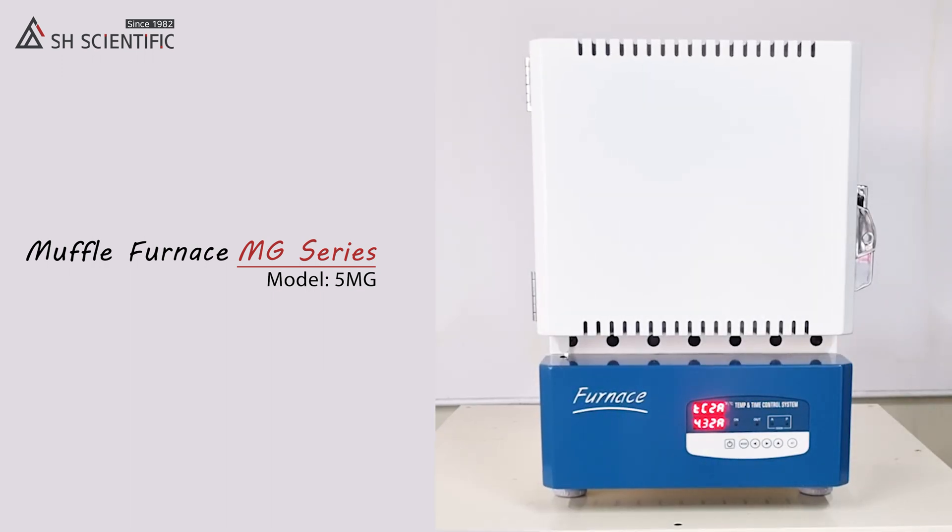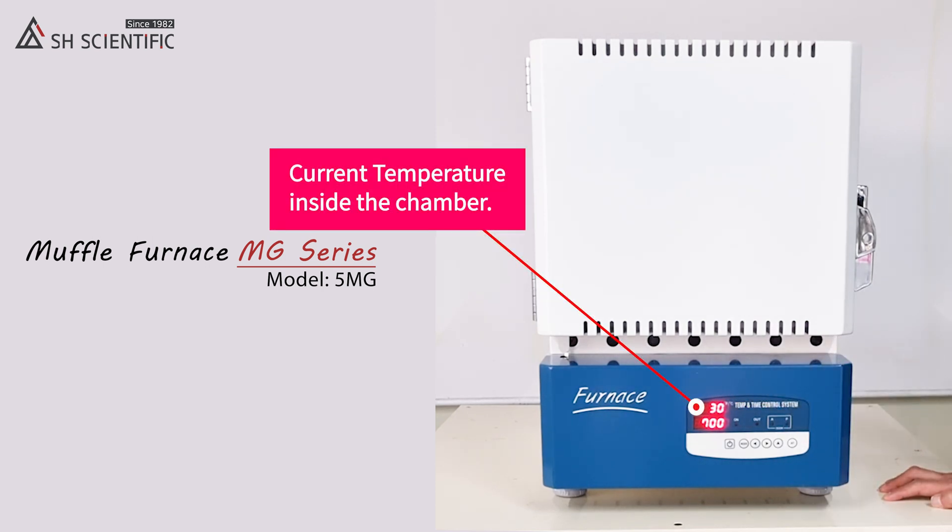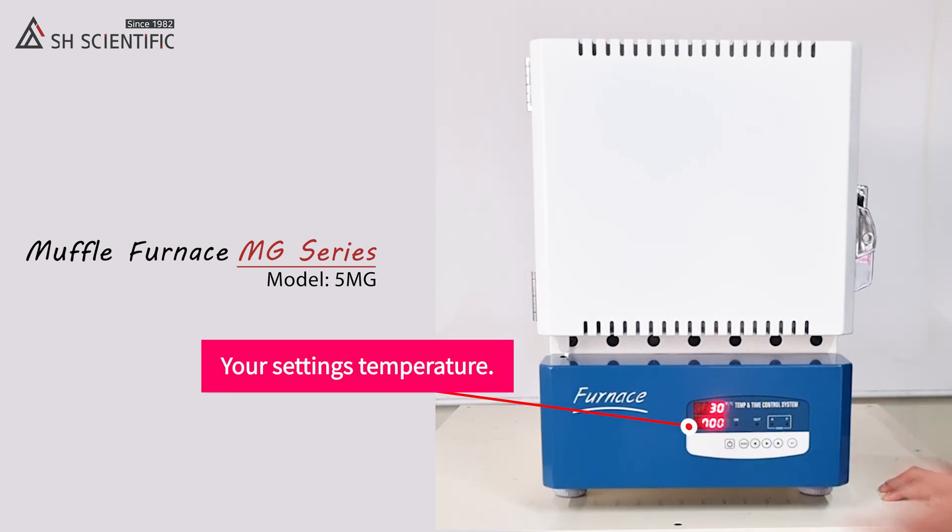Next, turn on the main power switch. The temperature on top is the current temperature inside the chamber, and the temperature on the bottom is your set temperature.